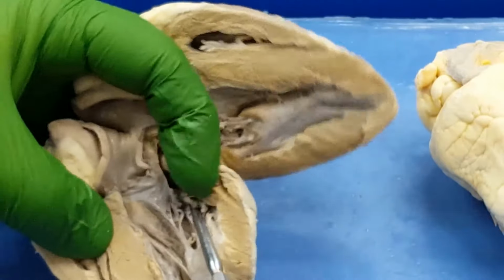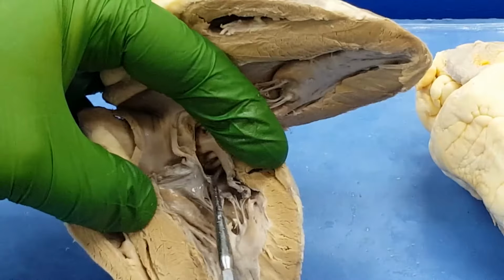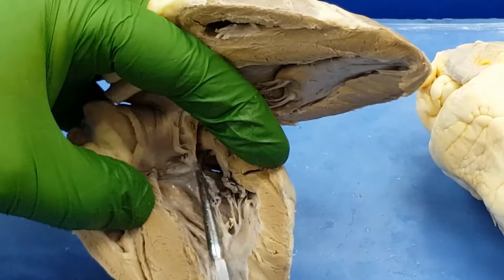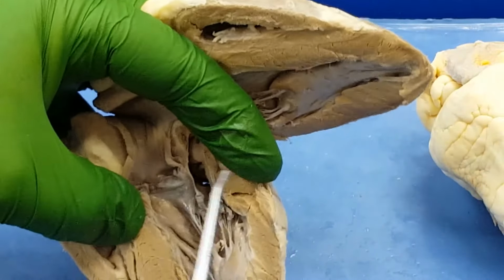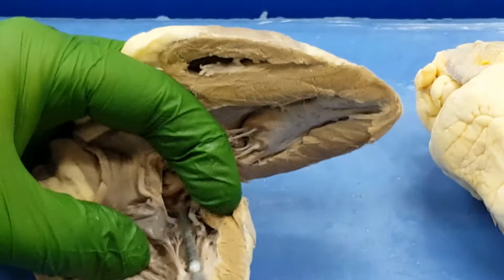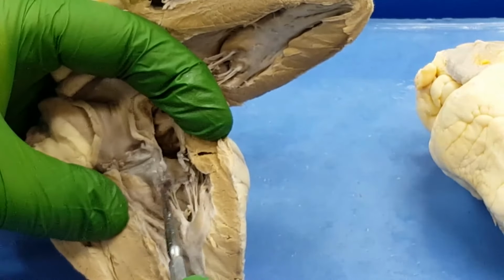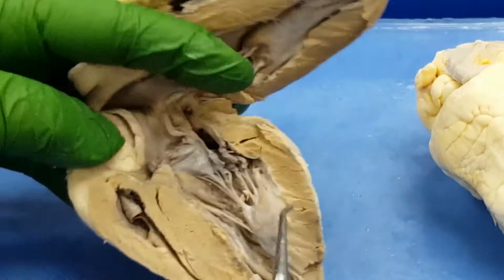I'll try to expand it with my fingers. There it is. See that endocardium right there? The left atrium. Right there. I'm doing the best camera work I can here. It'll be a little more obvious, I'm sure, in the practice section, but I want to do my best here. So as I expand this out, left atrium, through the valve, left ventricle.